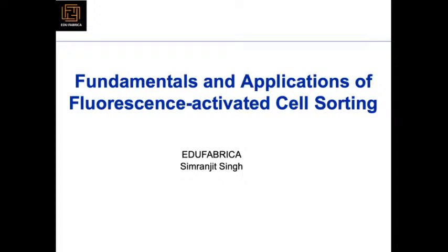In fluorescence activated sorting, you add some fluorescence to your cells. When they are activated, they give different fluorescence. If you have two different cell types like CD14 and CD8, and you want different fluorescence coming up, you can check with the help of the fluorescence activated cell sorting machine, the FACS machine, with different colors coming up, and then you will have different fluorescence for different cells.